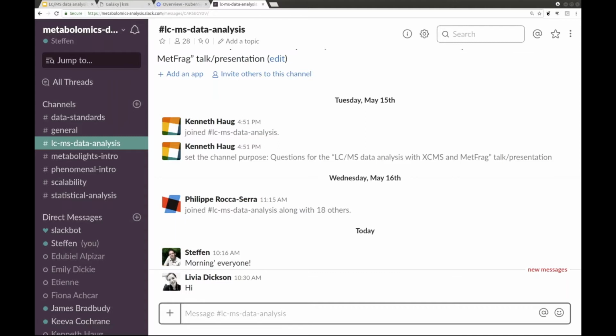So the first question was, are these analyses made using LCMS or LCMSMS? This was right at the start of the talk. So, obviously, MetFrag uses LCMSMS, but I don't know if you want to add anything. I can probably mention the way this has been done. This was using auto MSMS.